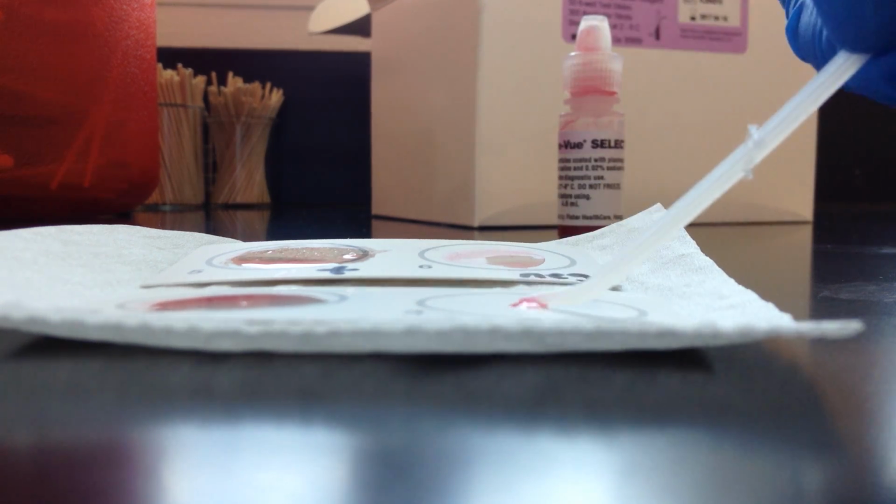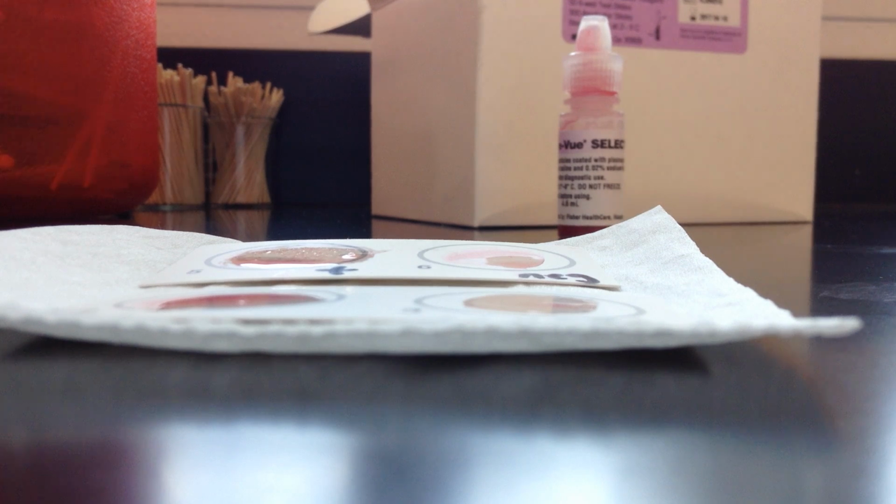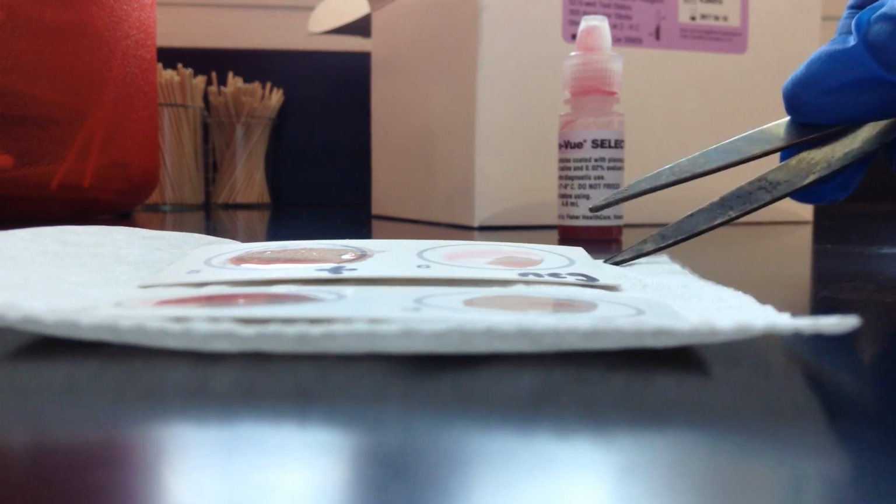Now, the coagulase test is used as a confirmation test, actually, for Staphylococcus aureus. That's the major pathogen that we're looking at here that we're concerned about as having the coagulase activity. So after you've narrowed it down to Staphylococcus aureus, then that would be the time to do the coagulase test at that point as a confirmation test, and that's how it's done clinically.